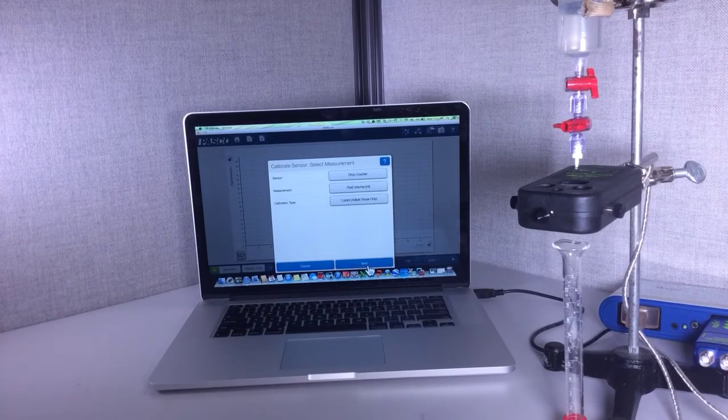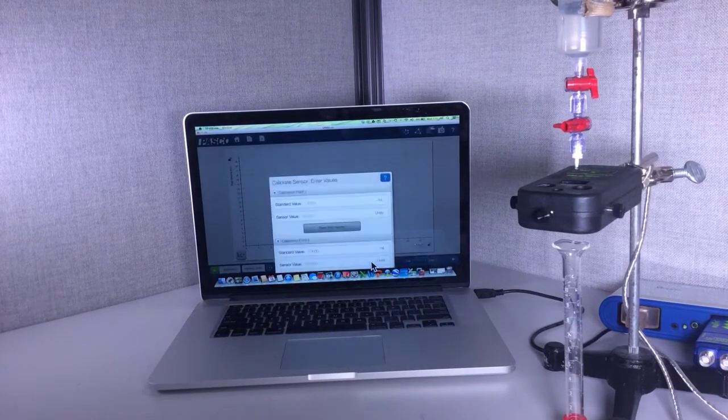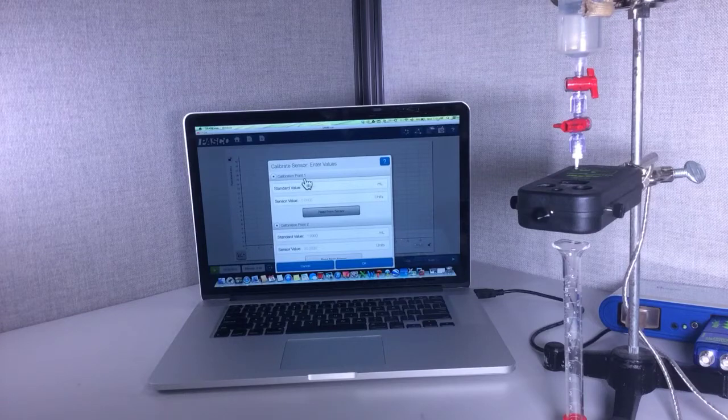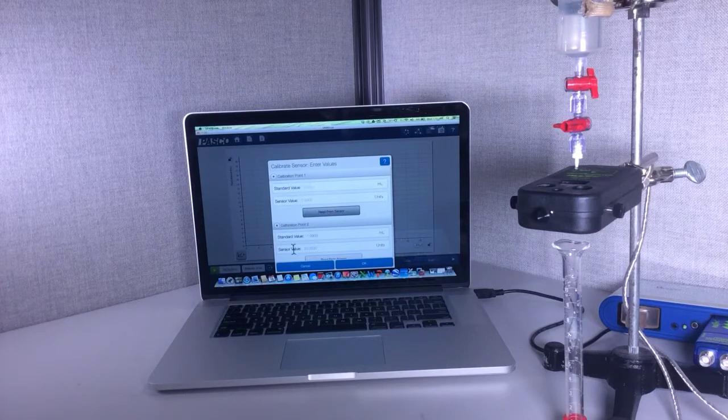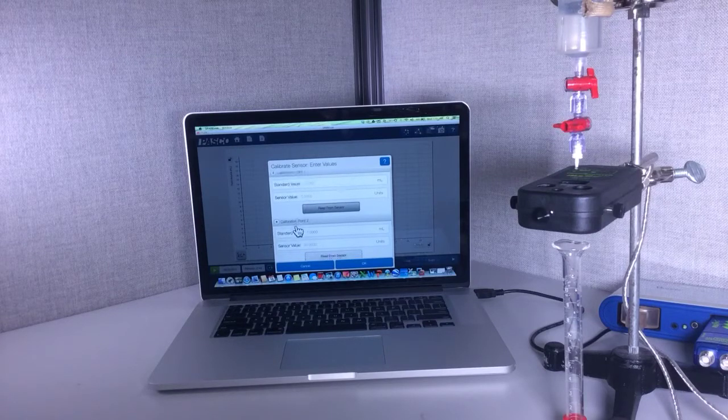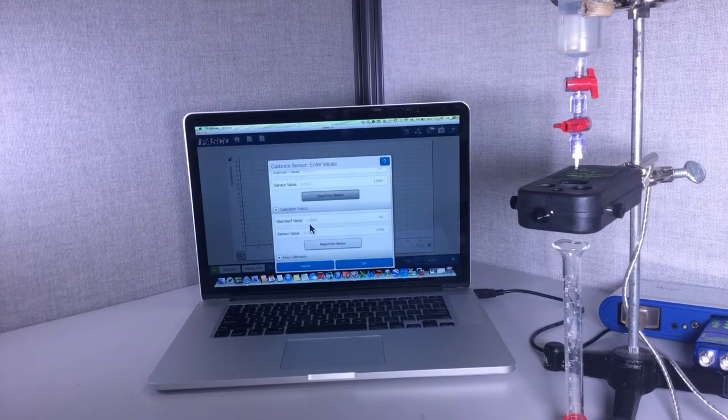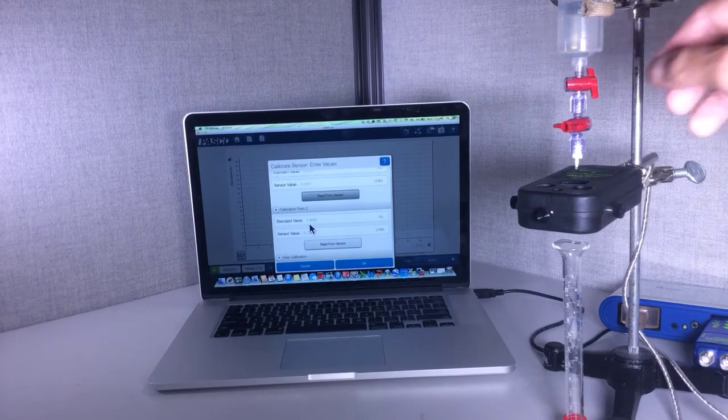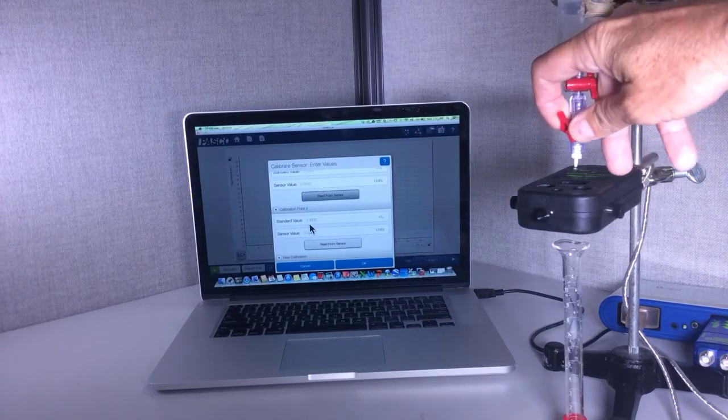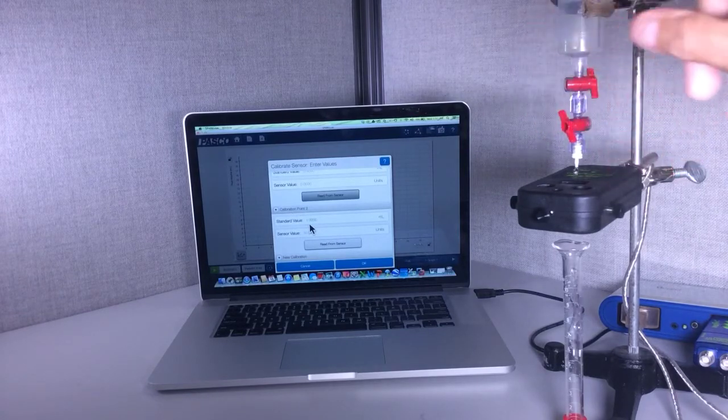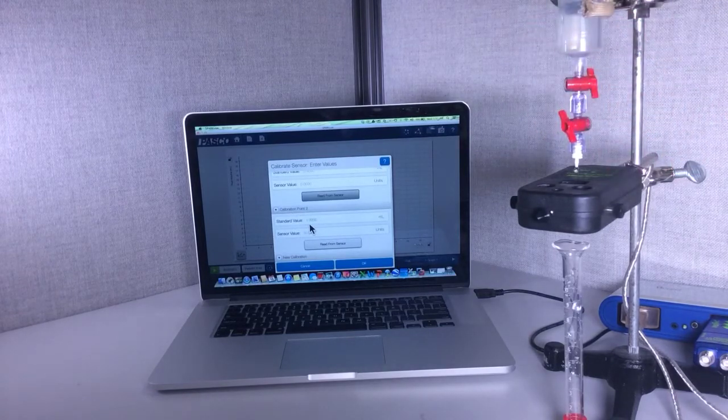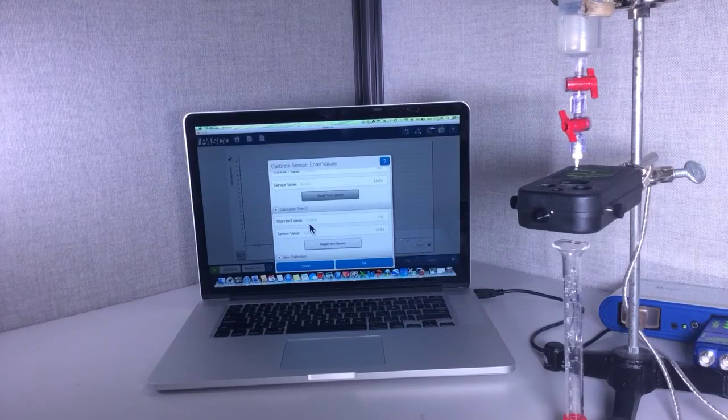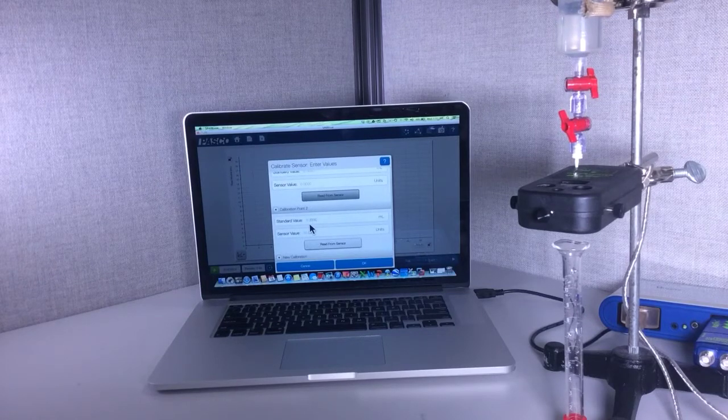I'm going to hit next. I'm not interested in calibration point one but I am interested in calibration two, this one here. What I'm going to do is open up that bottom and let a volume drip through. It's collecting here in the graduated cylinder.